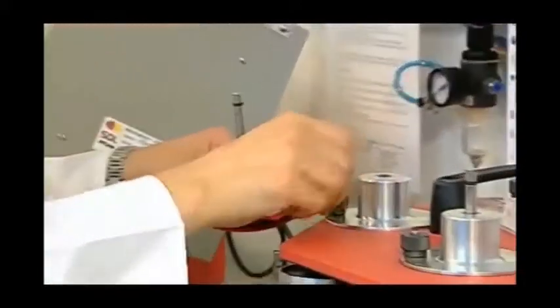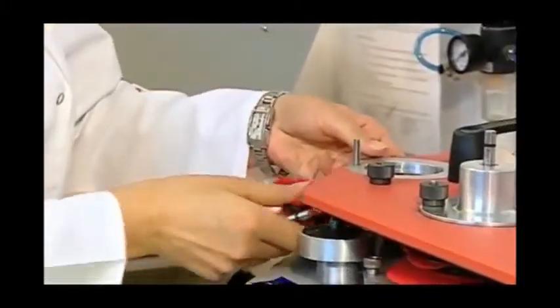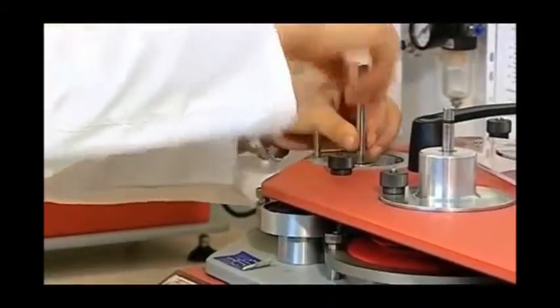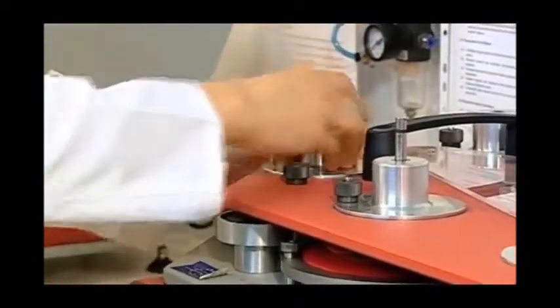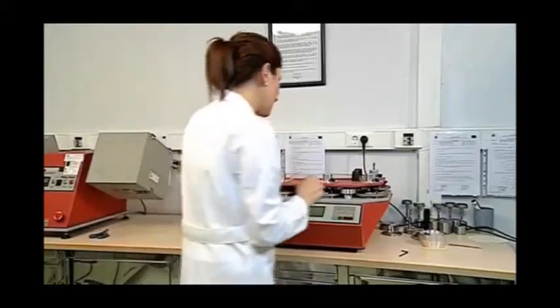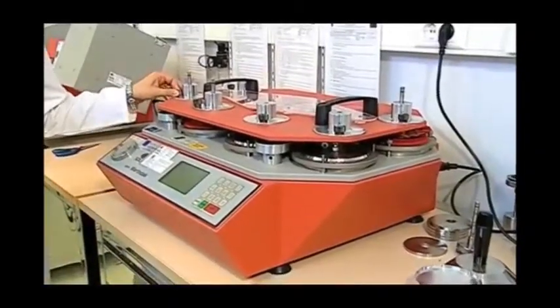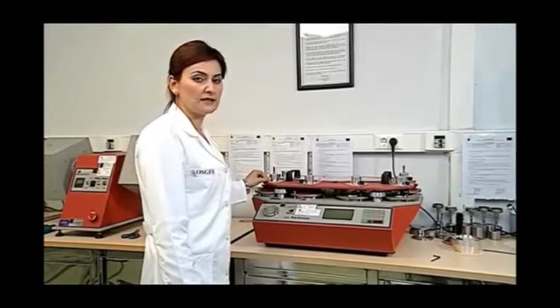Likewise, we place the samples in the sample holder number on the table in a way that their surfaces face each other. In accordance with standards, the number of abrasive frictions is checked at 125, 500, 1000, 2000, 7000 rubs.